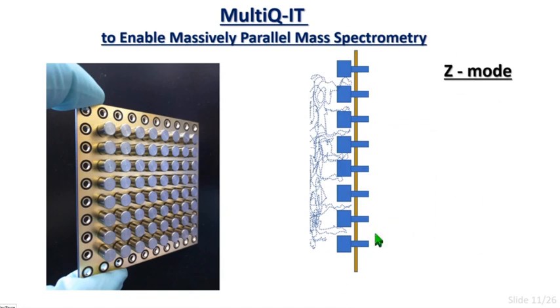So, a much easier mode to organize and observe is the Z mode. All we needed to observe this mode is to reduce this potential from 2 volts to a few hundred millivolts.